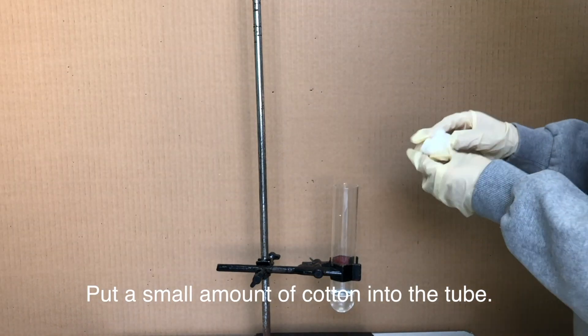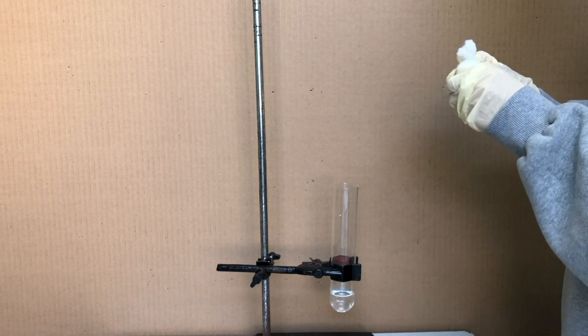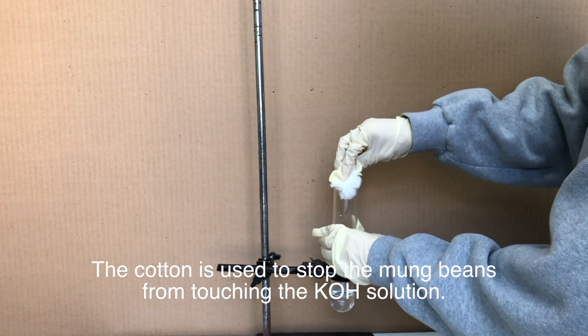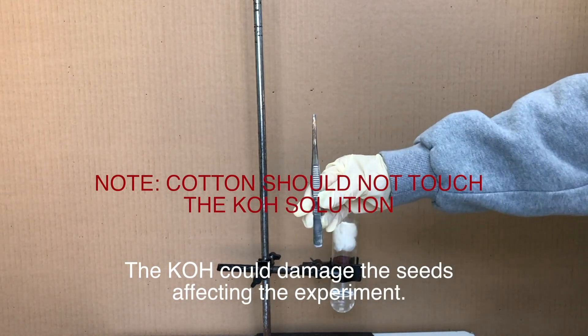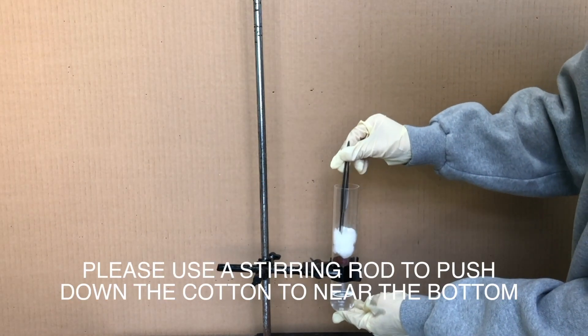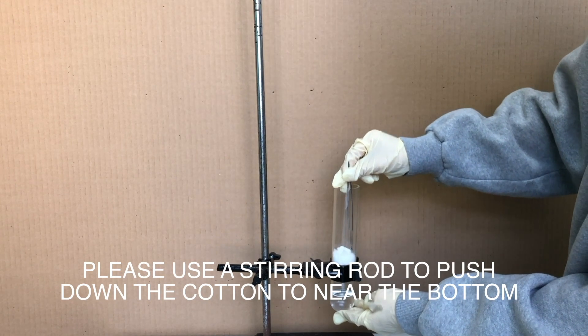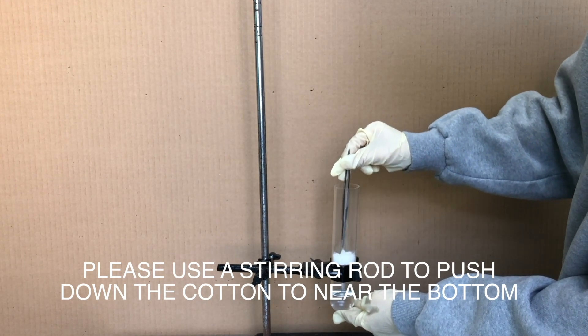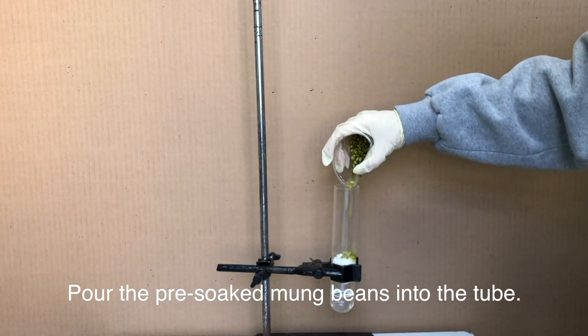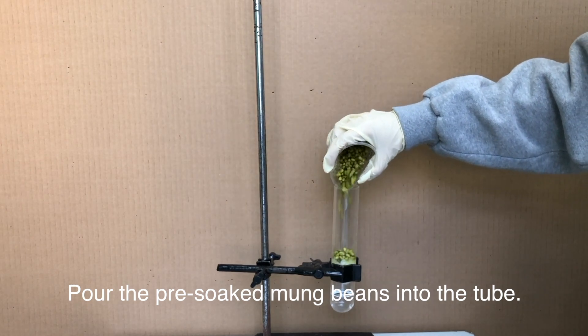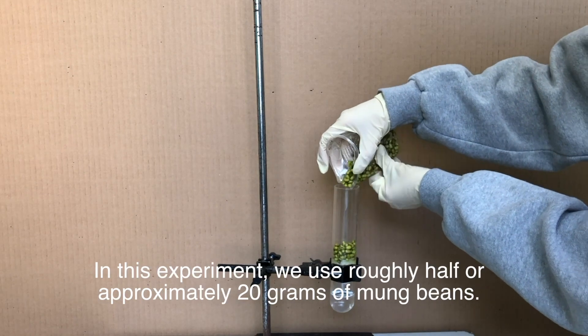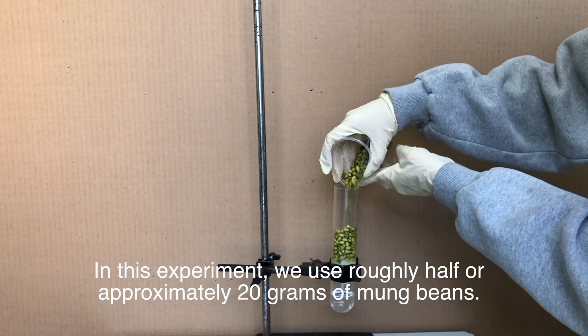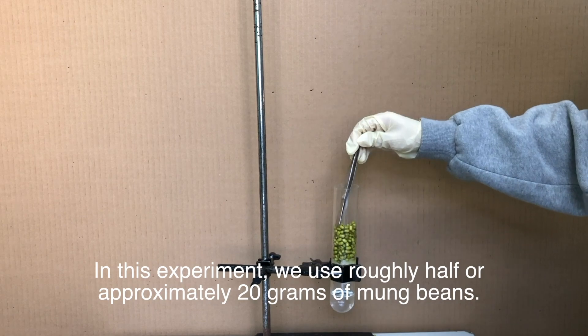Put a small amount of cotton into the tube. The cotton is used to stop the mung beans from touching the KOH solution. The KOH could damage the seeds affecting the experiment. Please use a stirring rod to push down the cotton to near the bottom. Pour the pre-soaked mung beans into the tube. The mass of the mung beans can be of your choosing. In this experiment, we used roughly half or approximately 20 grams of mung beans.